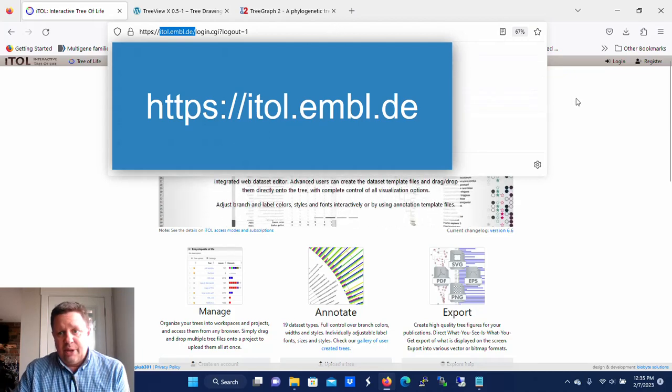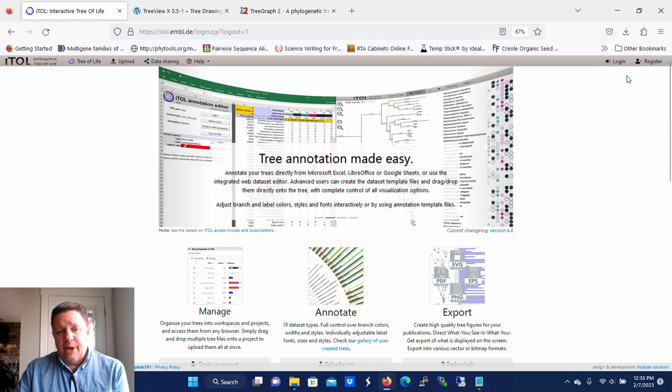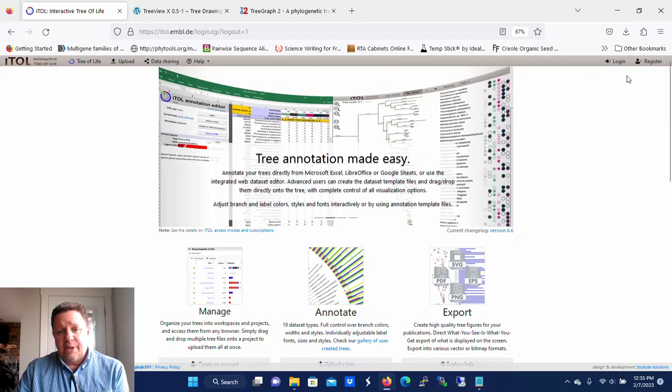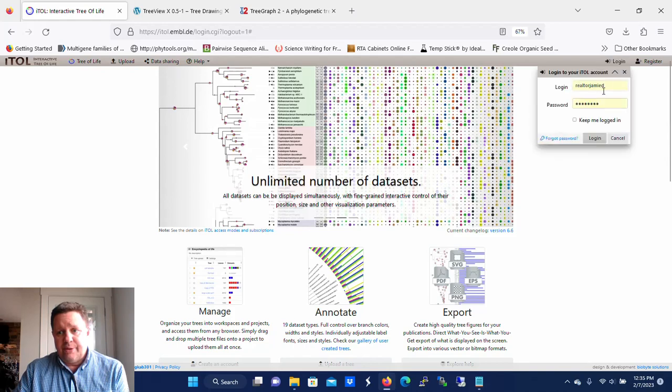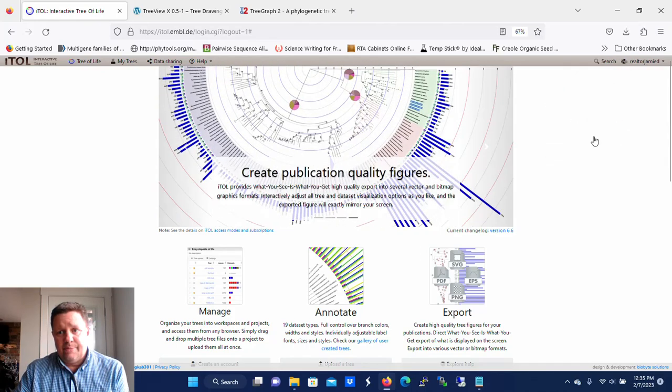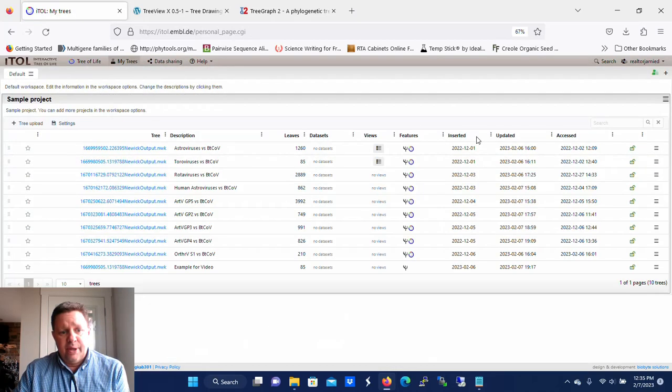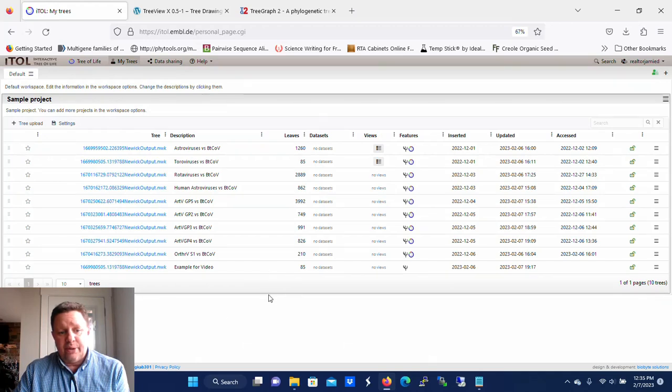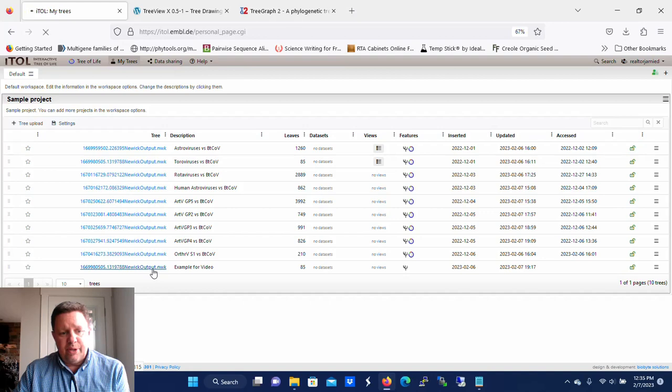Go to that website and once you've registered and you have your username and password, you can log in. I'm going to go ahead and log in. Once you're in, you're going to want to go to My Trees and import a tree into iTOL. In this case, I have an example tree that I brought in that has 85 leaves on it, so I'm going to go to that tree.